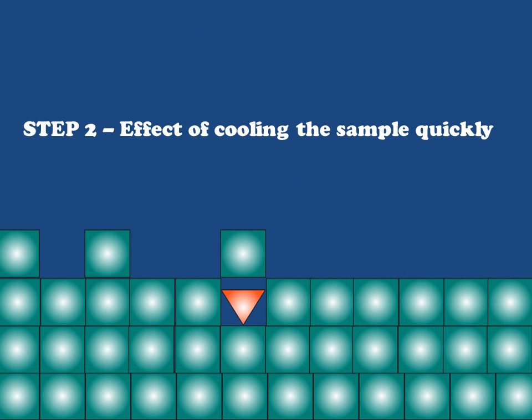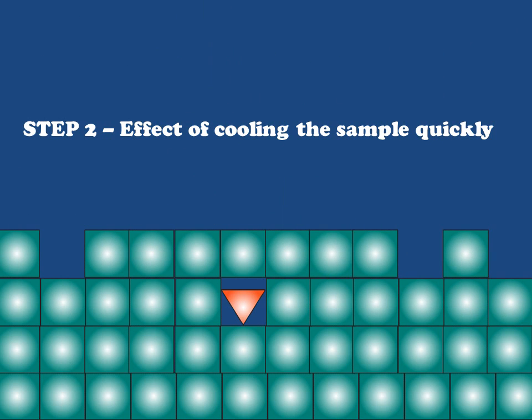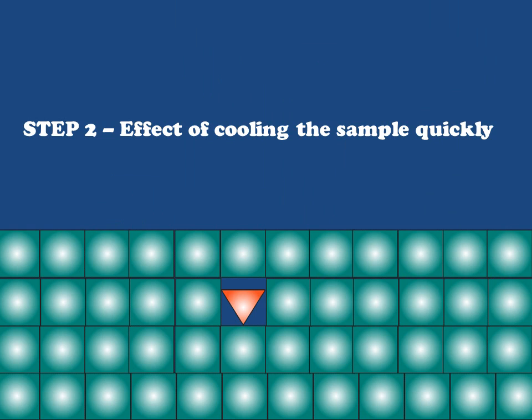We can't remove the impurity anymore. It's entombed within the growing crystal and we're right back where we started. This is why cooling slowly is so very important during a recrystallization experiment.